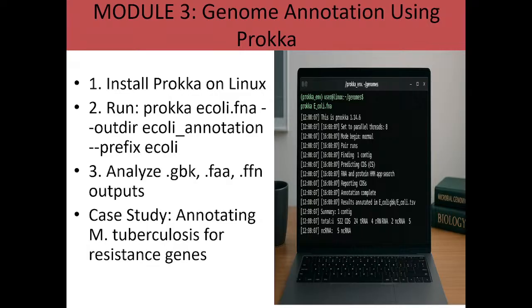And when you look at the right side of your screen, you will see that this has been run on a small laptop. So whatever you are getting, always compare it with what you have on the visual, on the images by your side.